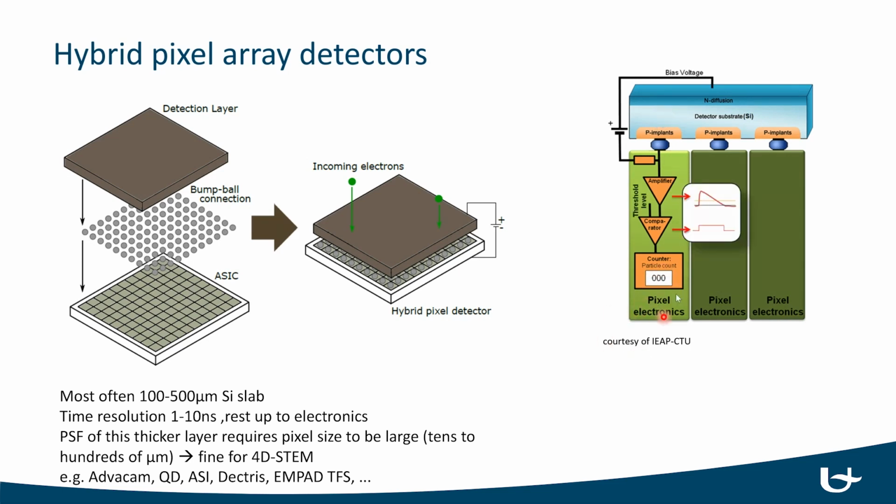But okay, you see the beautiful aspect, and you see how different this is from staying in the analog domain and just converting the analog signal into a noisy image, as before with CCD cameras, for instance. Now you really detect event per event, you leave the analog domain, and you are really working with electron events.